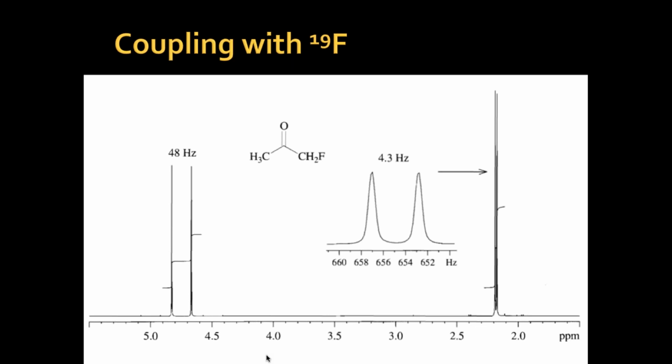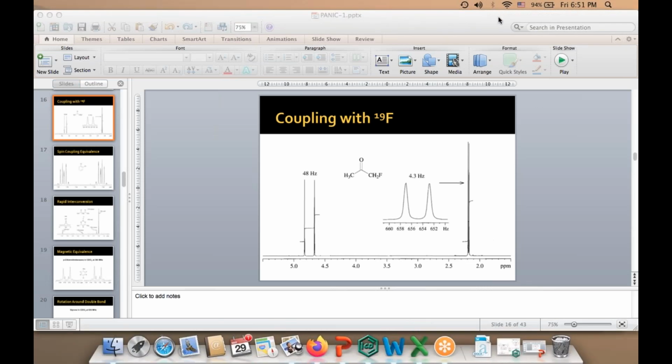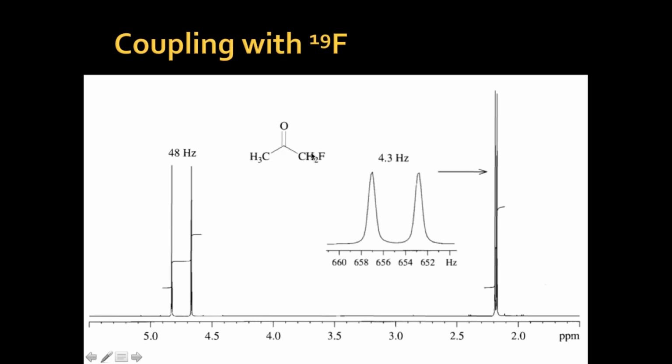As you can see, and remember, fluorine shows very strong coupling. It shows wide range coupling, long range coupling. Long range coupling means, see, CH3COCH2F.